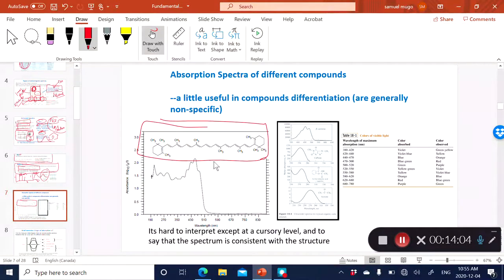And so the more complex the structure and the higher the molecular weight, the more you get a very undefined kind of spectrum. Look at this, you've got caffeine on the other hand. You can see the kind of band I get is not very broad and complex, because you don't have a very big molecule.